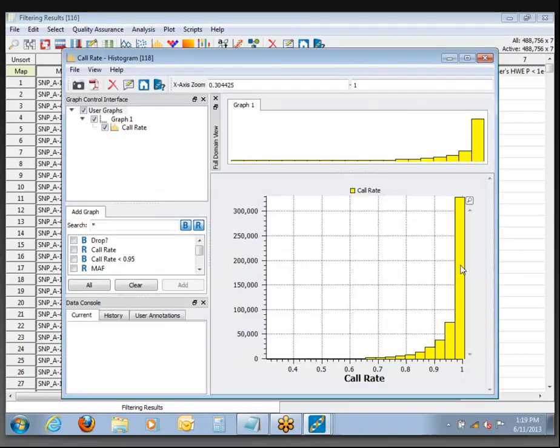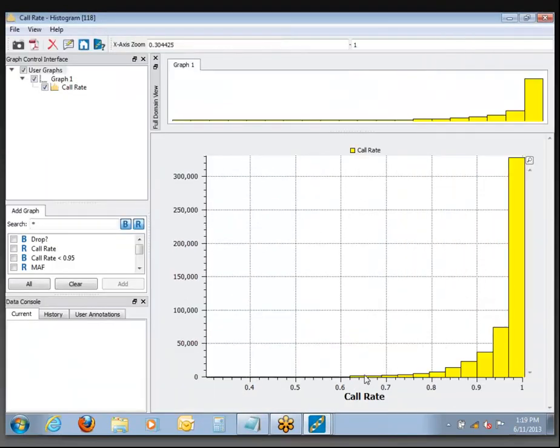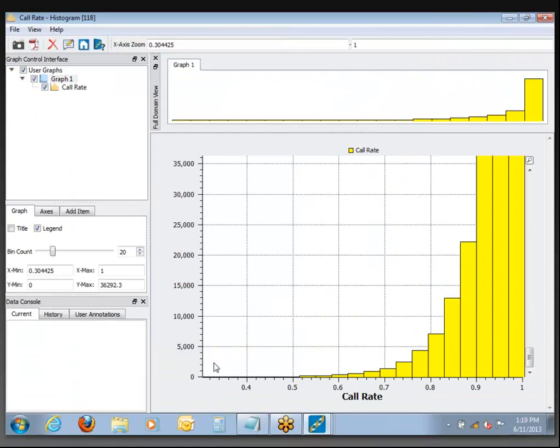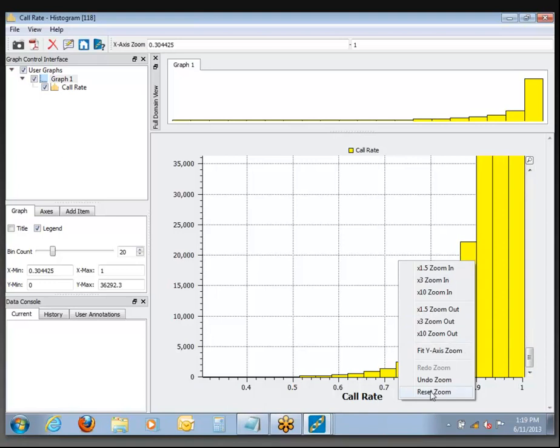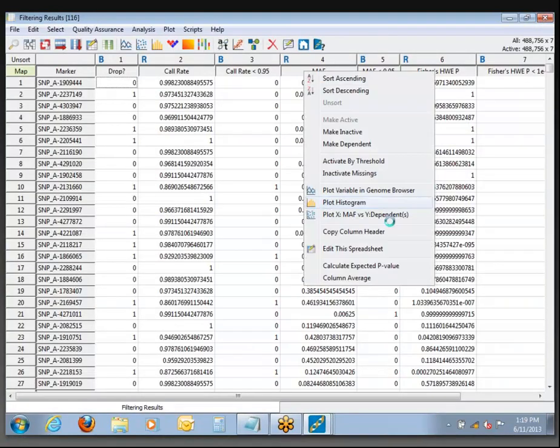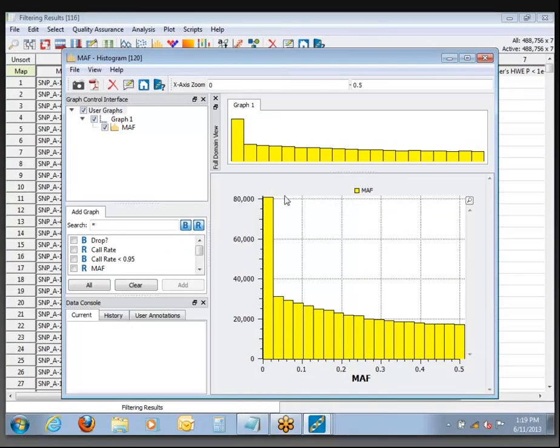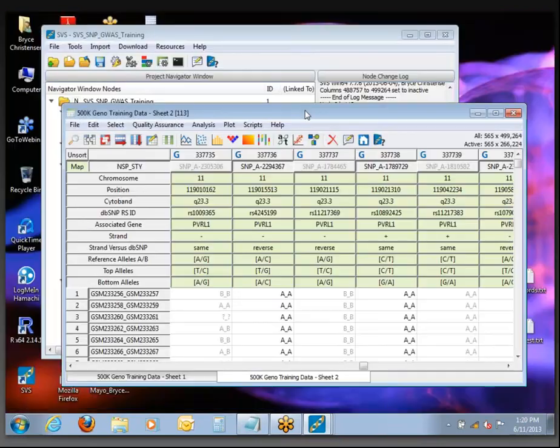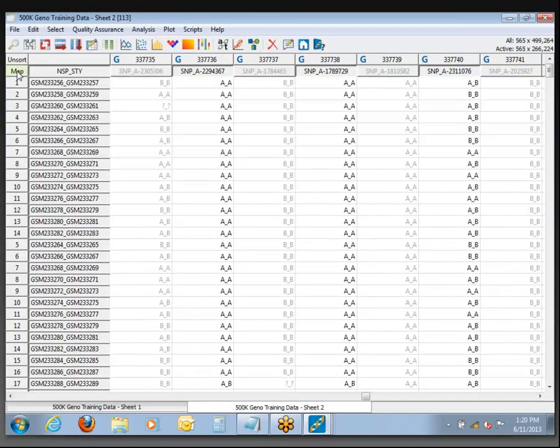We could plot histograms if we wanted to see distributions. This data has a pretty low call rate — this is old Affymetrix 500k data; it's not the greatest quality. Putting in that frequency threshold at 95% really dropped a lot of SNPs out. Also, looking at the allele frequency, there are a lot of SNPs that are very rare in this particular population — probably SNPs on the chip because they are polymorphic in other populations. So those have all been removed now.